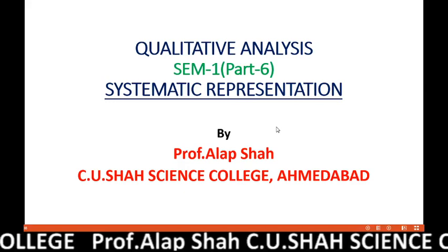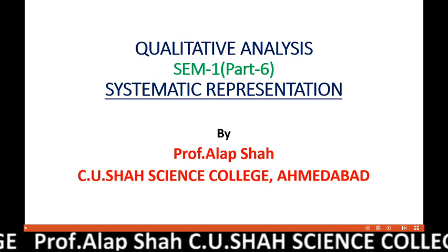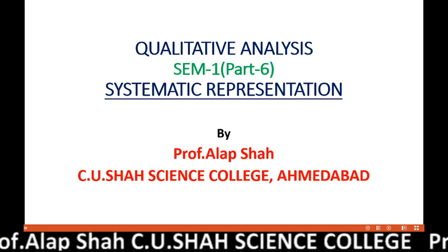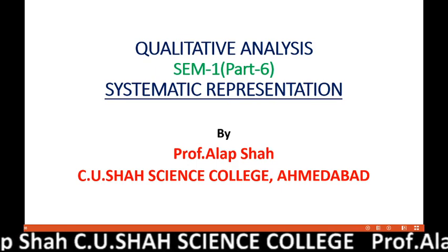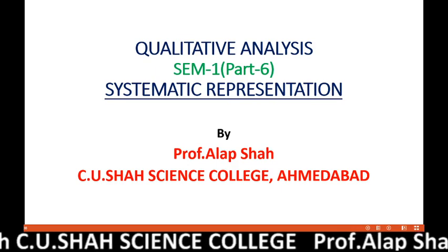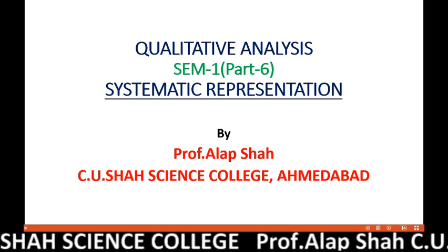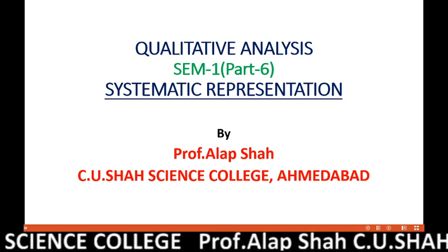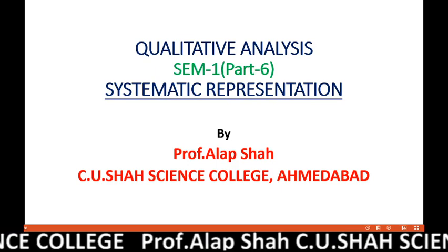Already in 5 different parts, we have discussed different aspects and tests of qualitative analysis for semester 1. We have discussed the introduction and primary test in part 1, dry test of the positive in the second part, dry test of negative in the third part, preparation of original solution and wet tests in the fourth part, and insoluble phosphate scheme in the fifth part. And in this last sixth part, we will discuss the whole practical, everything together, and how systematic representation of the practical can be done.